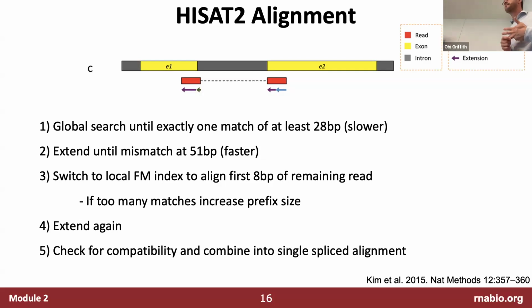If you know where the splice is in the transcript and then in the reference genome, could you not just search using that exon junction itself? You just grab the smaller middle piece of the sequence to do a more efficient search? So the question is, if you know where the exon-exon junctions are, couldn't you just check all the known exon positions rather than relying on this index?